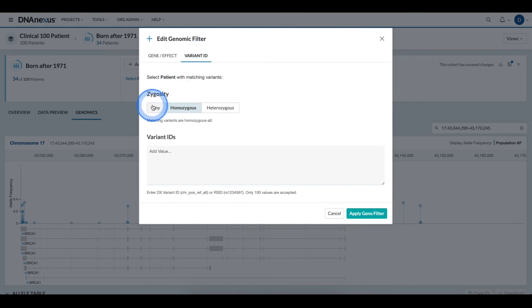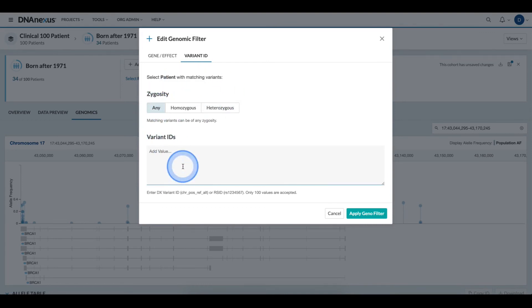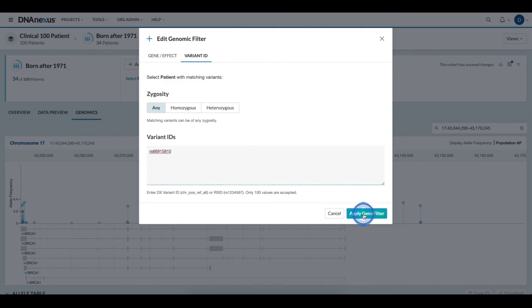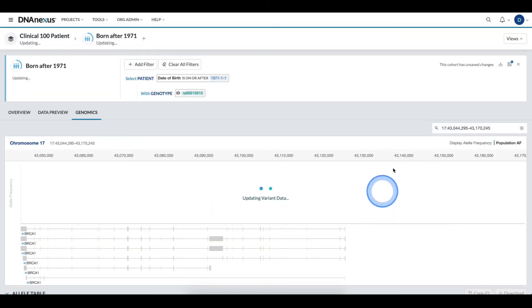Since I don't care about zygosity for this particular search, I will toggle the zygosity back to any and I'll type in my variant ID of interest, then click apply Geno filter.